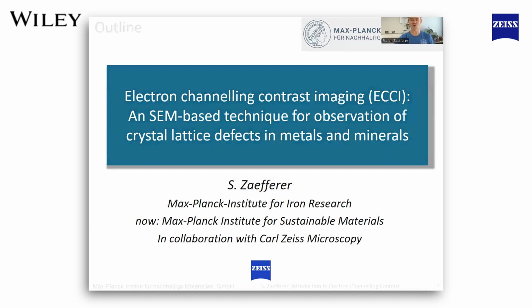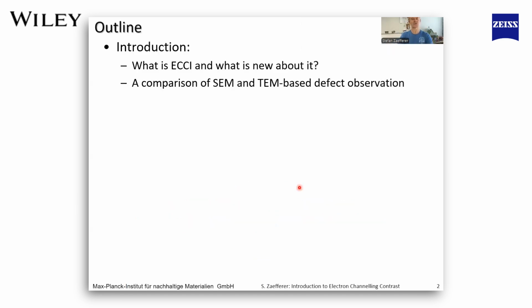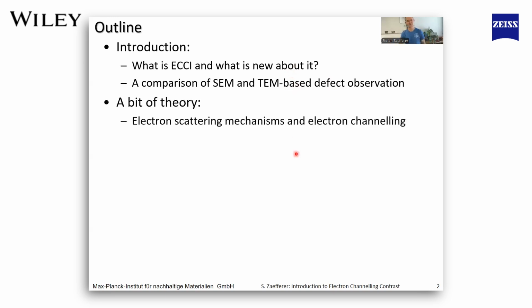So what am I going to show to you? I will first start with an introduction to the technique. That means I will show you what is ECCI generally and what is new about it. I will then compare the ECCI technique, which is an SEM-based technique, with the traditional TEM-based techniques for defect observations as an introduction. I will then go just a little bit through the theory, show you how the electron scattering mechanisms and electron channeling belong together.